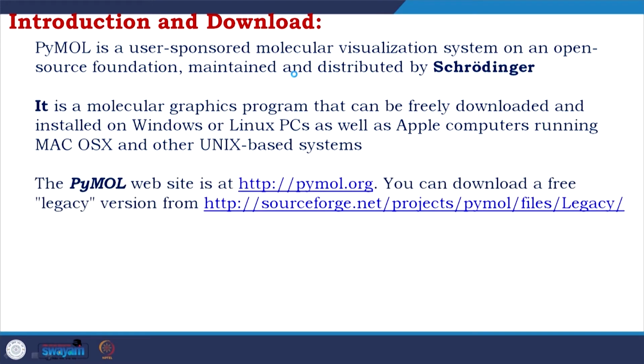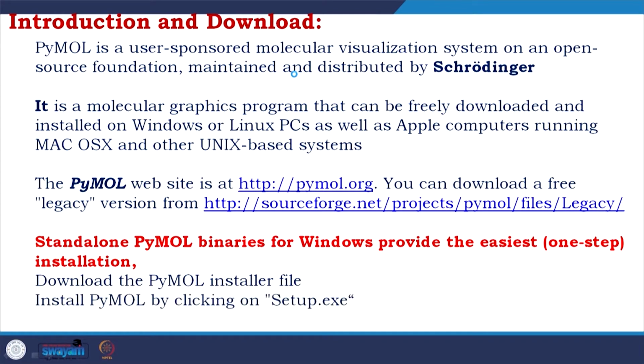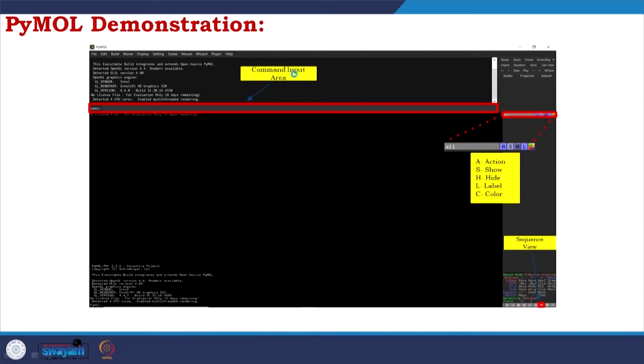These are the links, you could download it for free. Standalone Pymol binaries for Windows provide the easiest installation. You have to download the Pymol installer file, install Pymol by clicking on setup.exe and then Pymol could now be launched from the start menu of the computer.